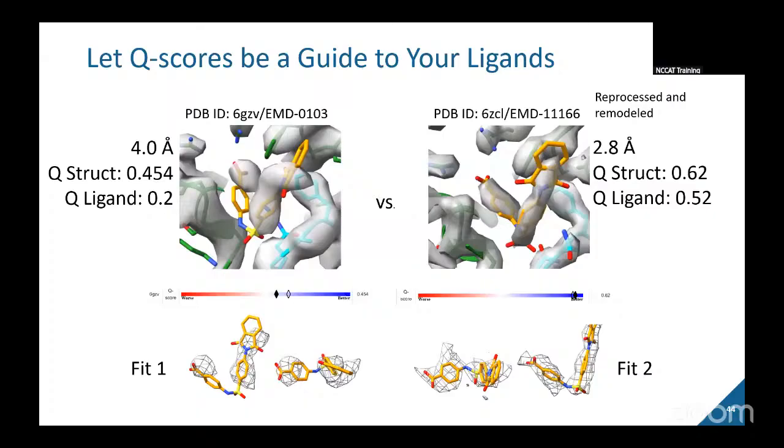So this is getting into this question about values. And then you can see the ligand Q, this is the key here. It is now much closer to the average Q for the full structure. And it's this enhancement that allowed me to model the ligand to where it was a better match to the experimental data. So the thing to be aware of is that ligands do often appear less resolved in reconstructions, and their Q-scores will lag for this reason. And so you really do want to pay attention to the discrepancy, because it is that local density that determines how good your model can be.